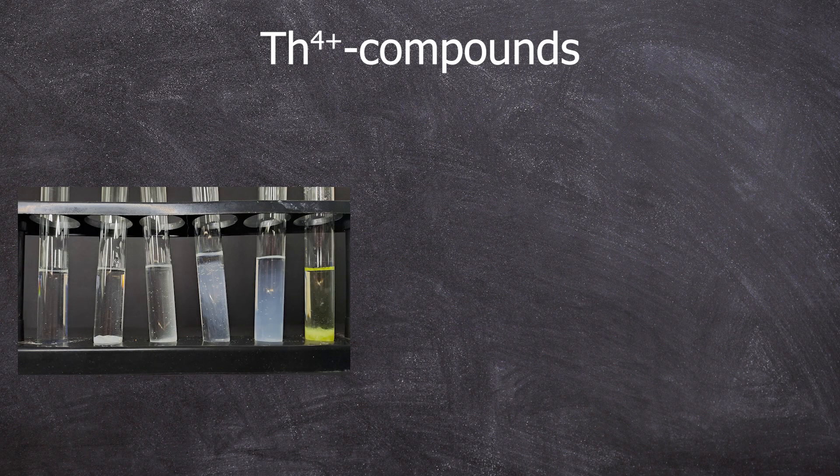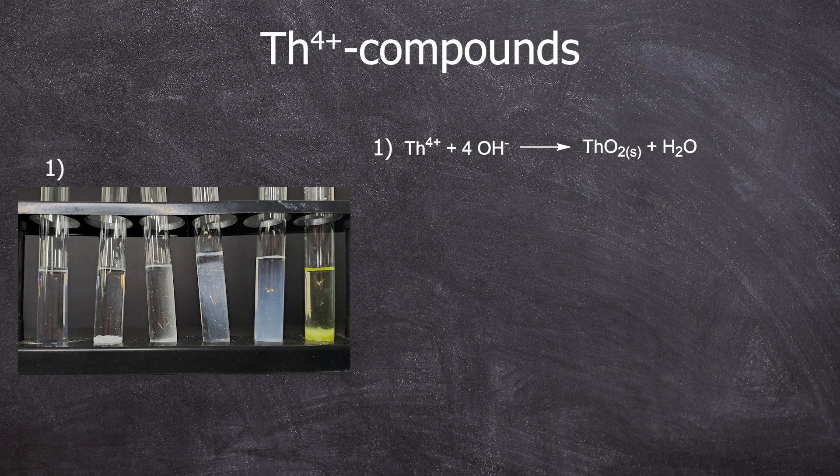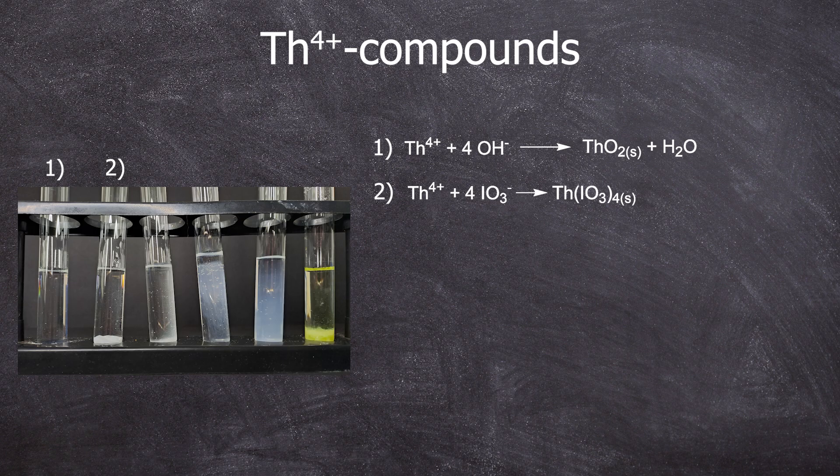Here is what was prepared in each test tube. To the first test tube we prepared thorium oxide with sodium hydroxide. In the next test tube thorium iodate was precipitated, a crucial detection method for thorium.